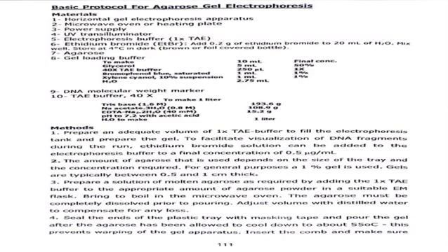Methods. 1. Prepare a volume of 1x TAE buffer to fill the electrophoresis tank and prepare the gel. To facilitate visualization of DNA fragments during the run, ethidium bromide solution can be added to the electrophoresis buffer to a final concentration of 0.5 microgram per milliliter.